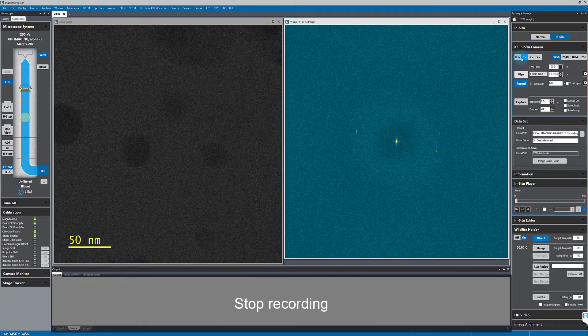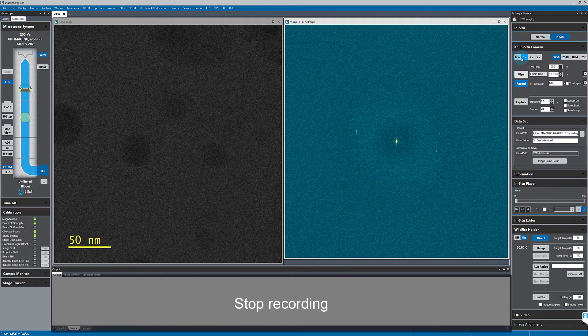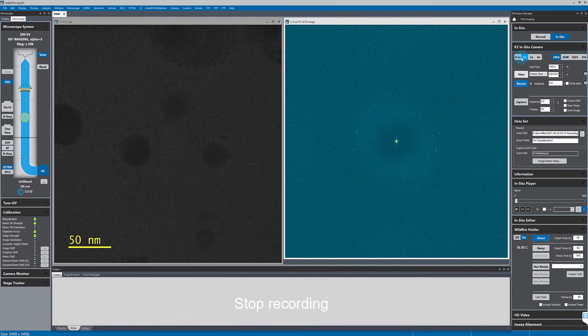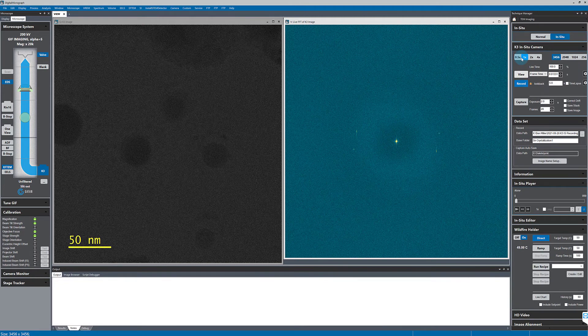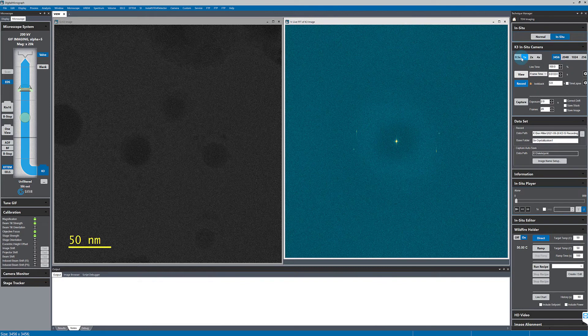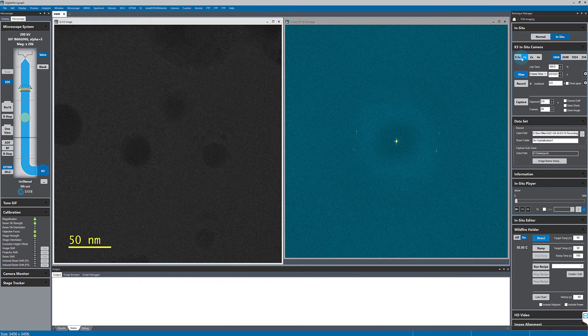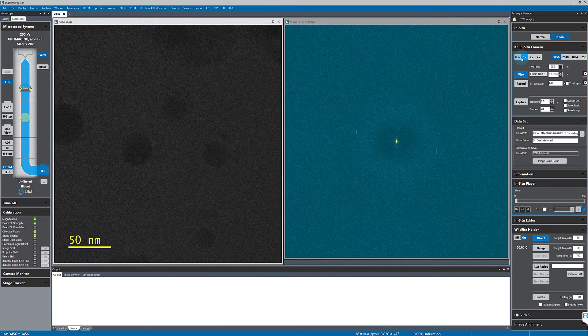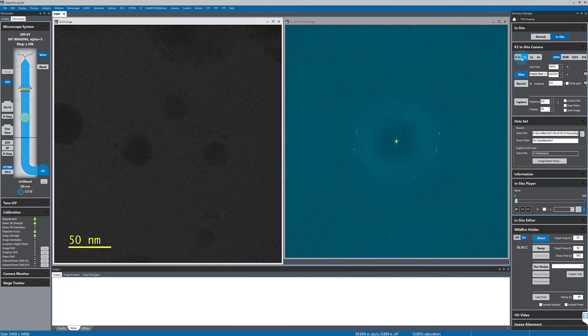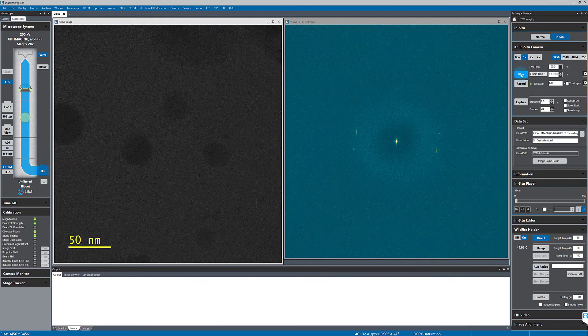The software will finish recording the last bit of data, and I'll open up the in-situ data set that I just collected.